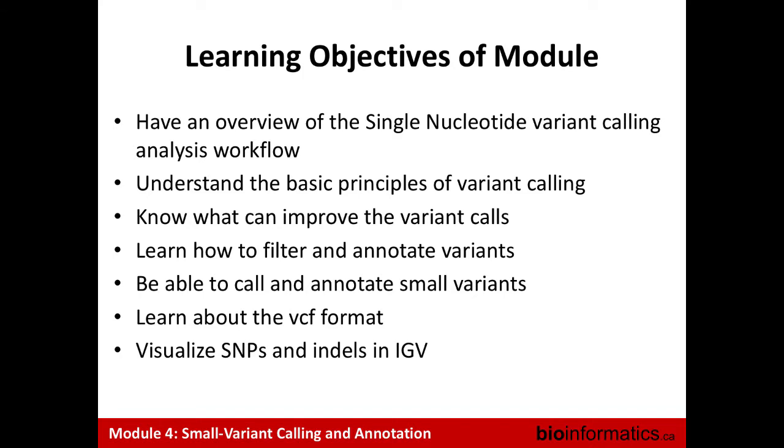What I hope you will learn today is to have an overview of the pipelines that we use to do the SNV calling, so single nucleotide variant calling. This pipeline is mainly inspired by what has been proposed in the GATK best practices.